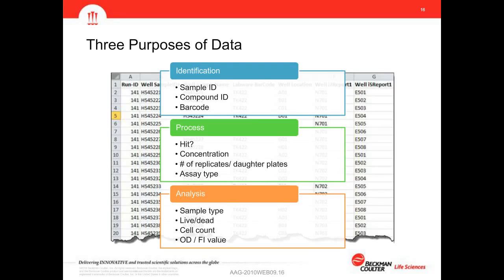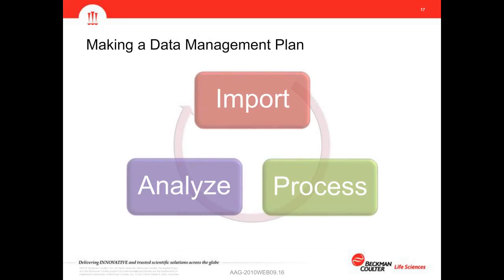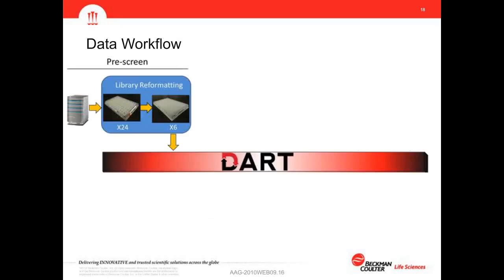It's really not about moving liquid or taking it to a reader. It's really about understanding the results of that read and being able to draw conclusions from it. So here we have a data management plan workflow. It goes through an import step, a processing step, and an analysis step. And then once you've drawn conclusions about your results, almost always there's a follow-on step, another process step begins. That might be downstream in another lab, or it might be you repeating results, confirming results, or retesting items. But this is the data workflow.